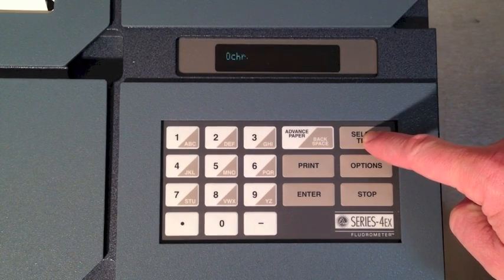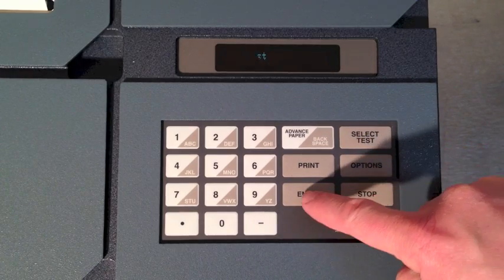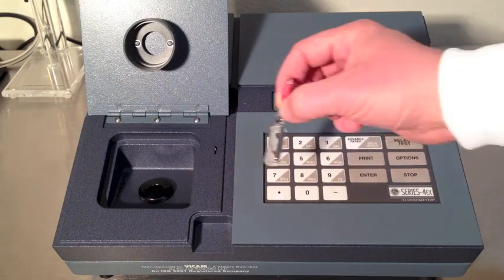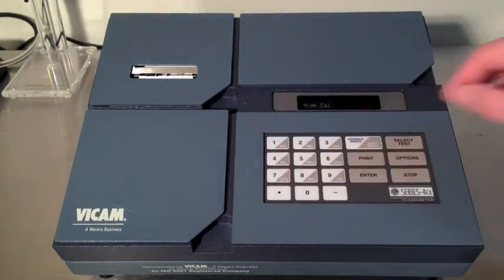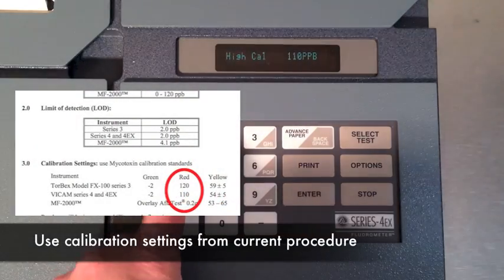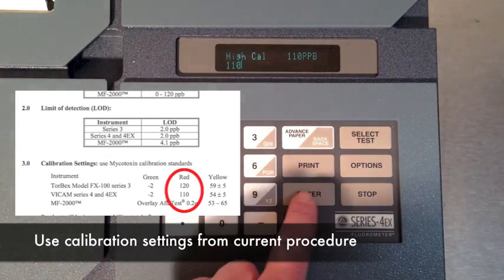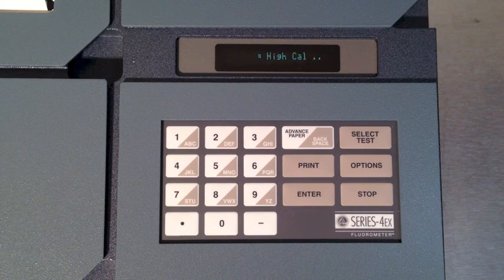This machine is capable of running several tests for toxins. Ask your Vicam representative for more information. Open the calibration standards box and insert the red vial. Close the box — the standards are light sensitive. The display will prompt for the red calibration setting. Refer to the current procedure for proper calibration settings. Press Enter to accept the setting. The machine will then click several times and you'll be prompted to remove the vial.